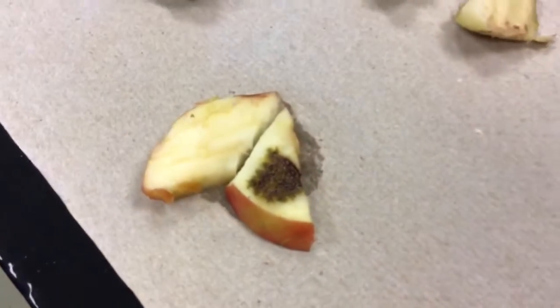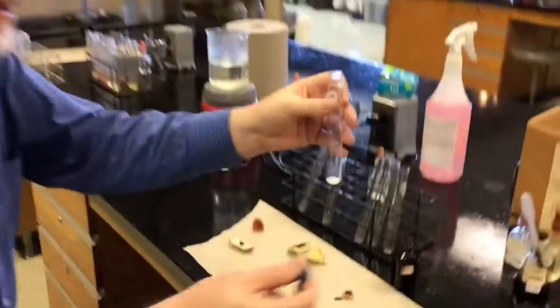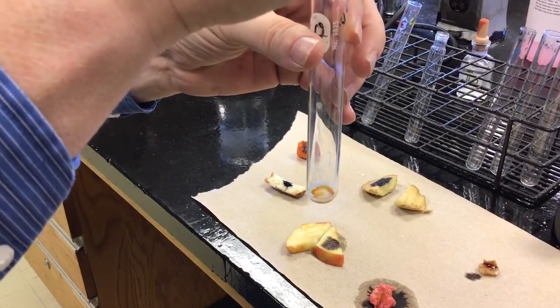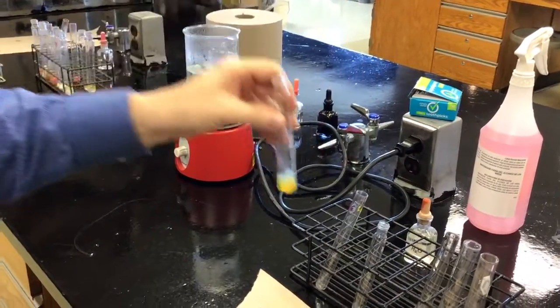Now, I need to set up test tubes for the liquid foods. So, come on back. This is the milk. We're putting 2 drops of Lugol's into the milk. And I would say we're not getting a black there.